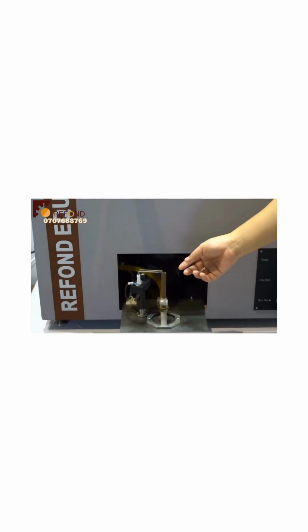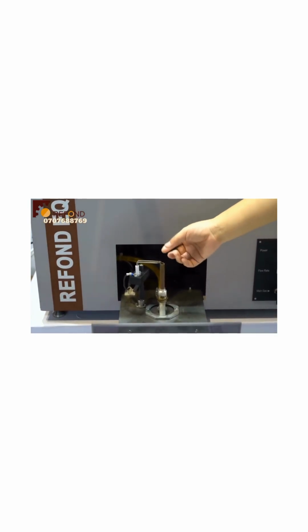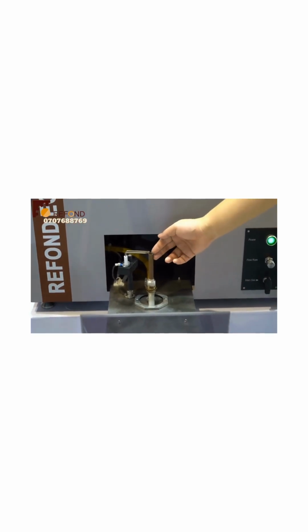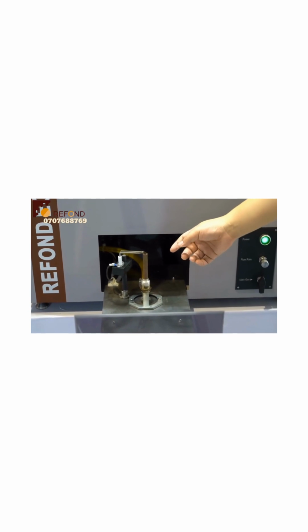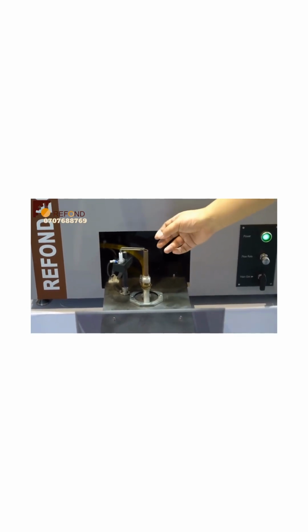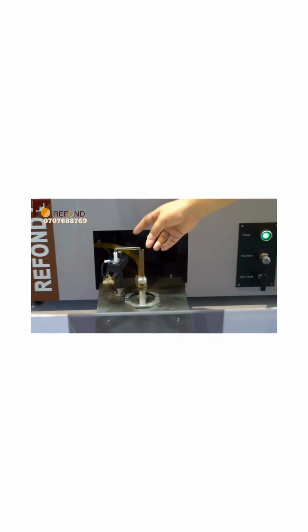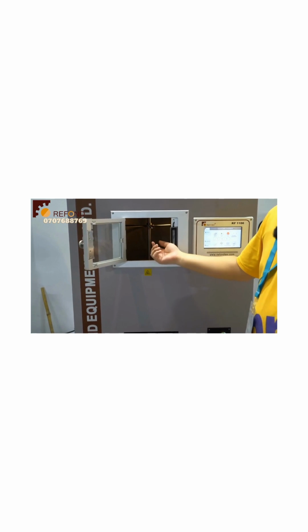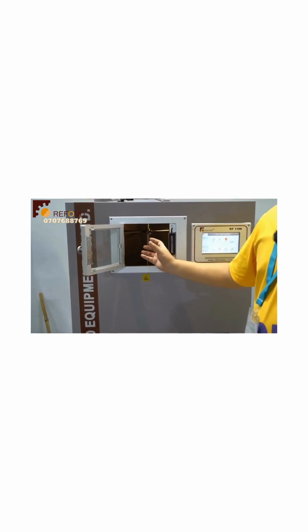A blue flame has a higher temperature than a yellow flame, and the higher temperature of the flame is what's generating the nitrogen oxides. The main components involved are nitrogen monoxide and nitrogen dioxide. These two chemicals will be created near the flame, and then they will follow the hot air up into the test chamber. Here, the sample rack will rotate slowly to make sure all the specimens are exposed to the nitrogen oxide evenly. The nitrogen oxide will cause the sample to change color.